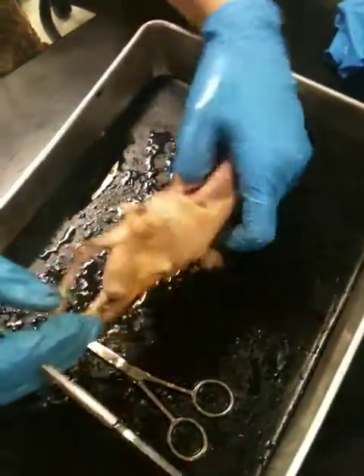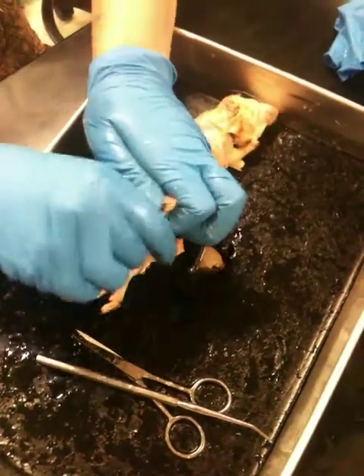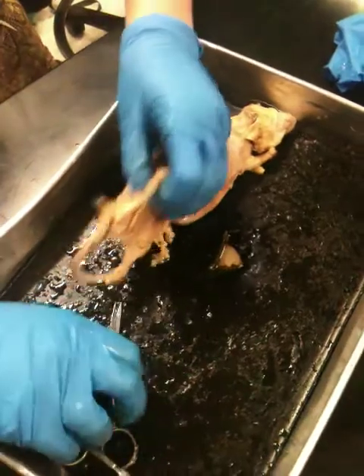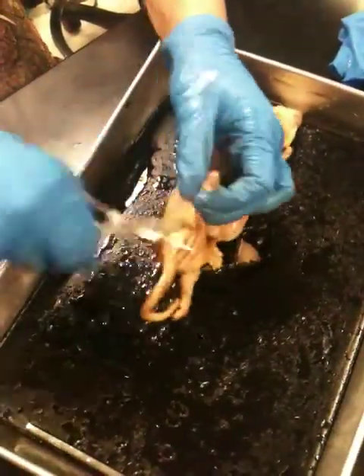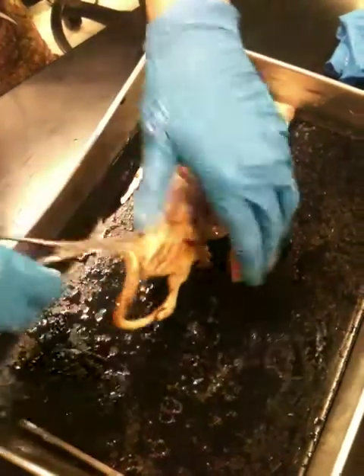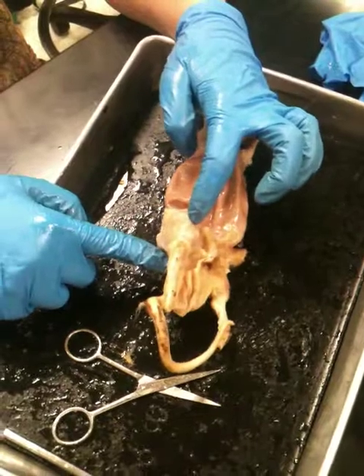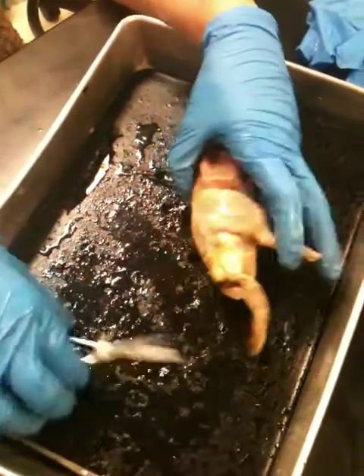The next thing that we're going to look at, and let me just make sure I can easily skin this a little further, just to make it easier. Oh, it's a little late for me on that, but that's okay. I'm just going to take this off a little bit. So right now, this is where you can actually see the kneecap of the rat. This is actually a heel of a rat, just for reference.